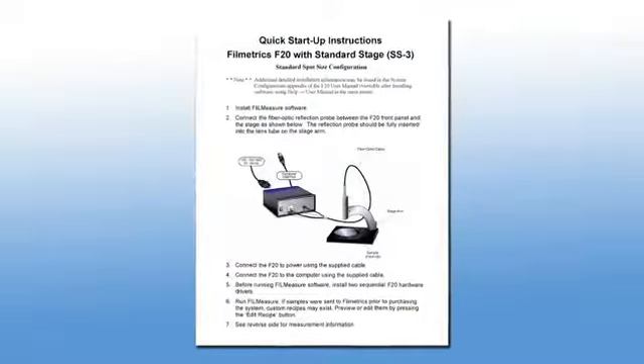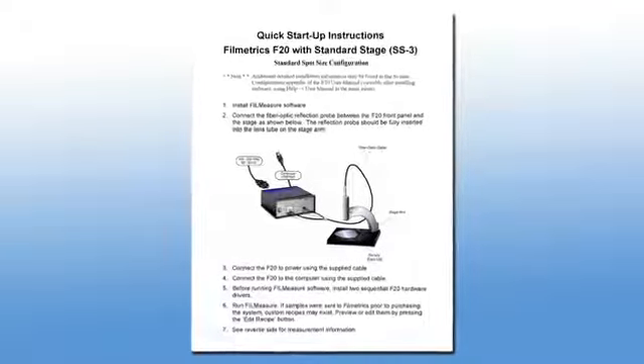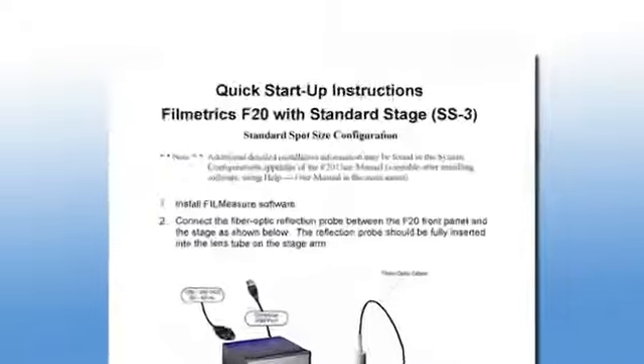Setting up a Filmetrix system is simple and takes less than 5 minutes. We will be following the quick start guide that is supplied with the system.